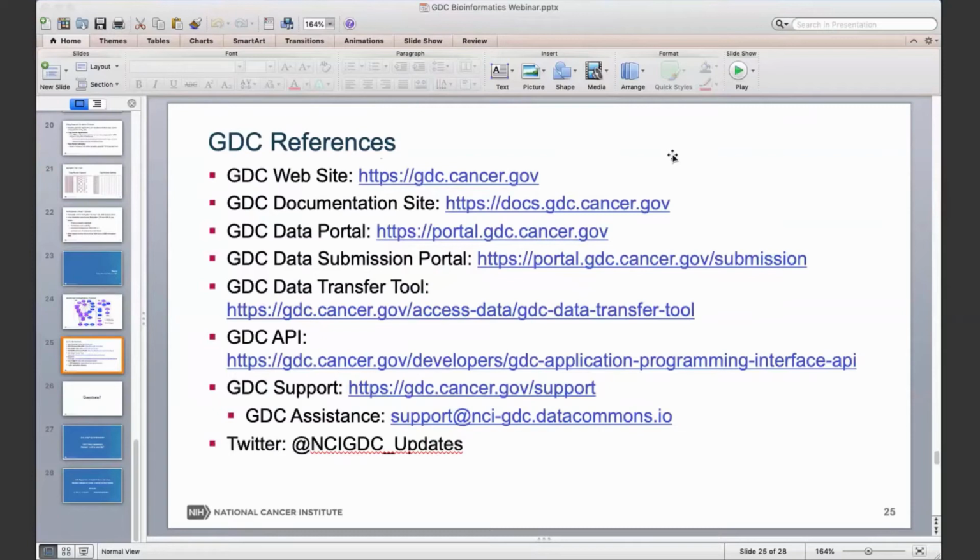One is we updated our MuTect2 from GATK3, which was for the tumor-normal paired pipeline, to GATK4. That provides better filtering and better calling quality for the tumor-only. And we also plug in another tool called PureCN. You can see that in Colin's slide.